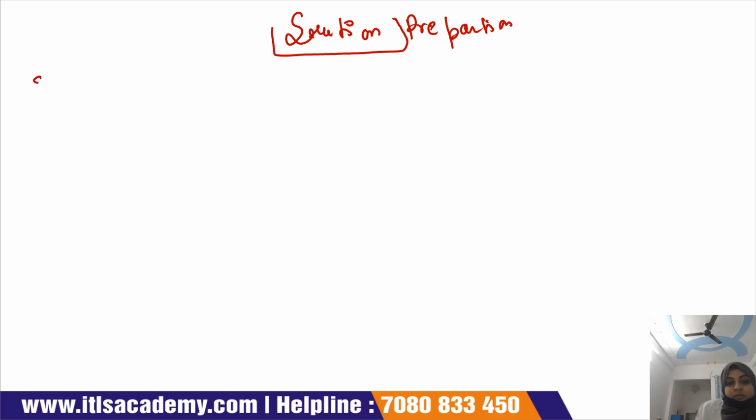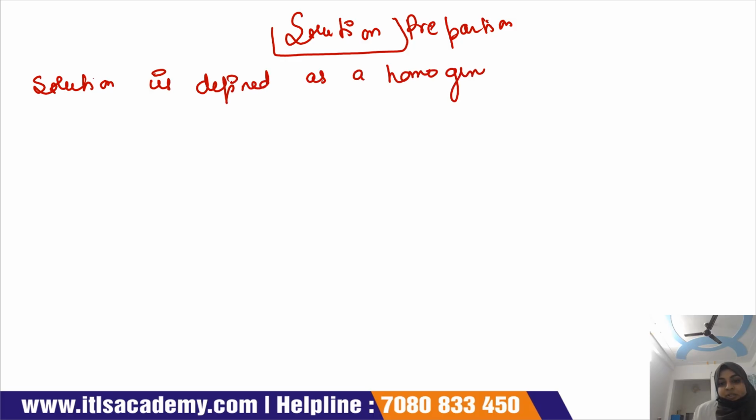Okay, so solution is defined as a homogeneous mixture of two or more compounds.